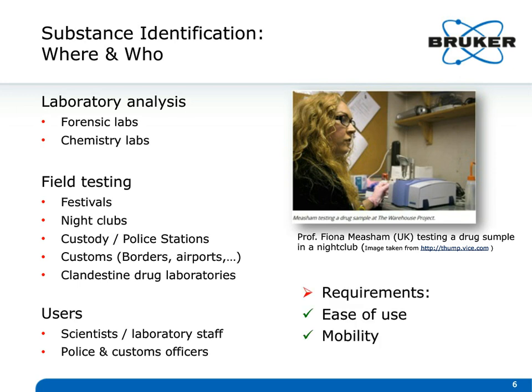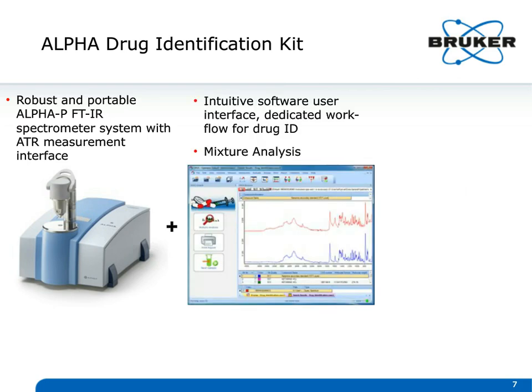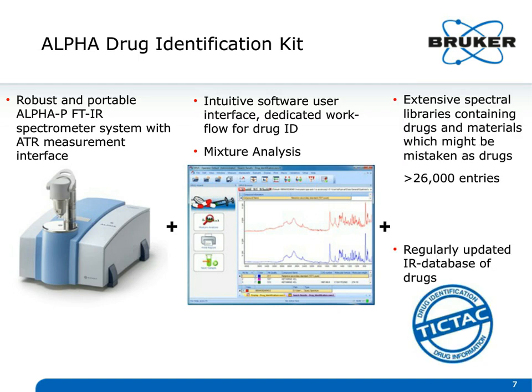So this is the Alpha spectrometer, and this is actually an important tool in the toolbox, a portable FTIR that only weighs a few pounds and can be taken out to the field. You can test the white powder or whatever drug you might suspect as a drug or explosive agent or whatever. And these databases for doing the analysis now are very well developed.